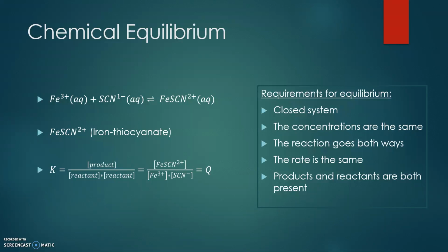This experiment is useful to understand equilibrium because iron thiocyanate is red and therefore visible when the reaction is at equilibrium, because iron thiocyanate is always present at equilibrium. It is then easy to observe the changes in color when we stress the reaction, which can tell us whether there has been a shift to the reactants or a shift to the products in order to re-establish equilibrium.